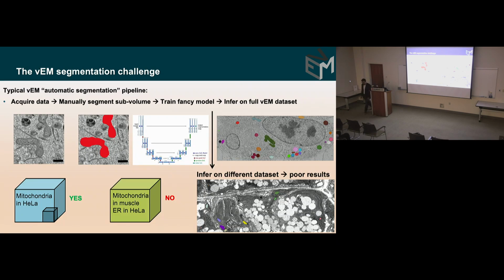What does generalization mean? So many of you may have heard of deep learning, and UNets are a favorite way of employing this. If you were to train a deep learning model, I should have had a slide on deep learning. Okay. There are multiple ways by which you can recognize features in an image.